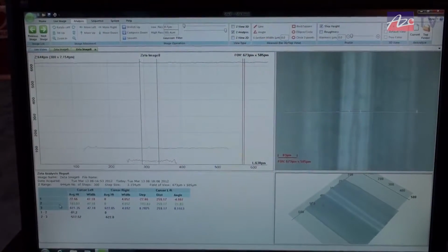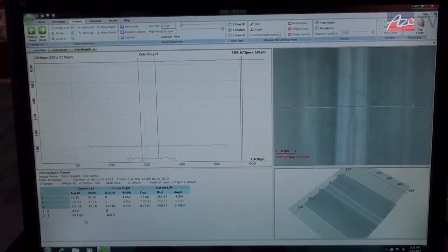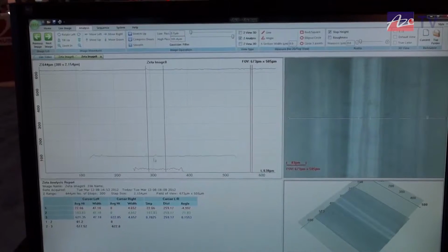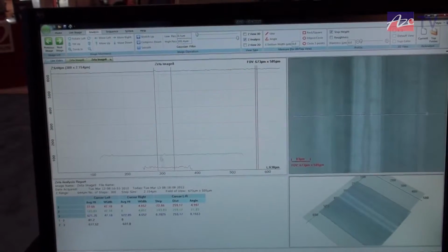In this particular measurement, I have a distance from the top to this layer, which is layers 2 to 3. They're also color coded. That's basically 517 microns deep times its refractive index. The air gap is literally here in this center section. It is roughly an 81 micron channel depth.